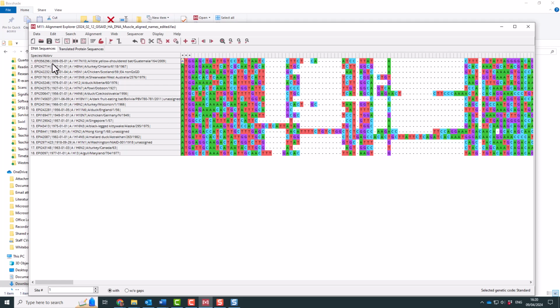I don't need to know the name. I don't particularly need to know the date that it was collected. I definitely don't need to know it's influenza A because it's the same for everyone. I probably don't need to know the organism it was taken from, and I did this extra bit in the dates and times. This can all disappear. I can just keep it down to just being each of the individual numbers for the H's, because this is an alignment of all the different hemagglutinin subtypes.